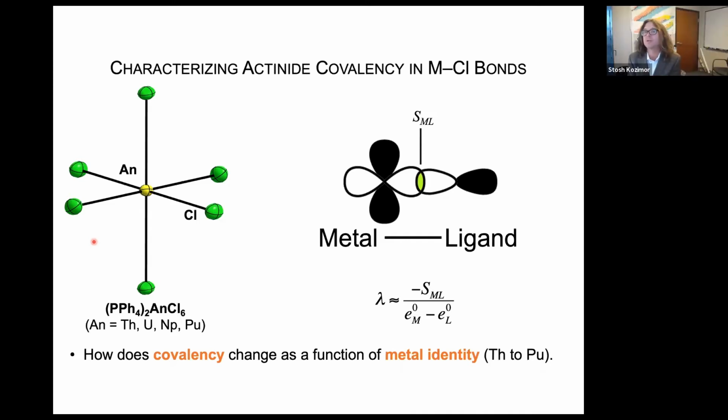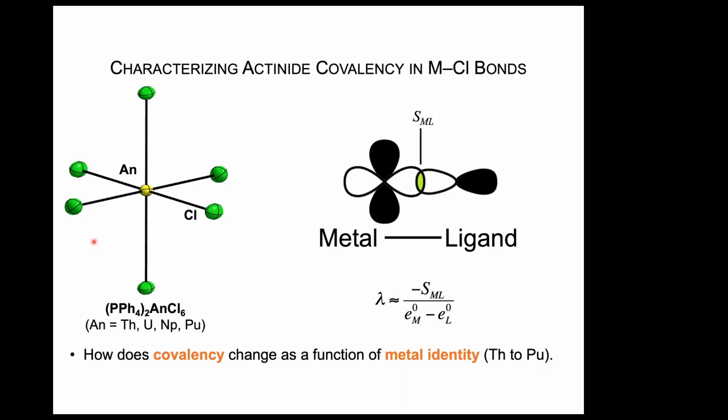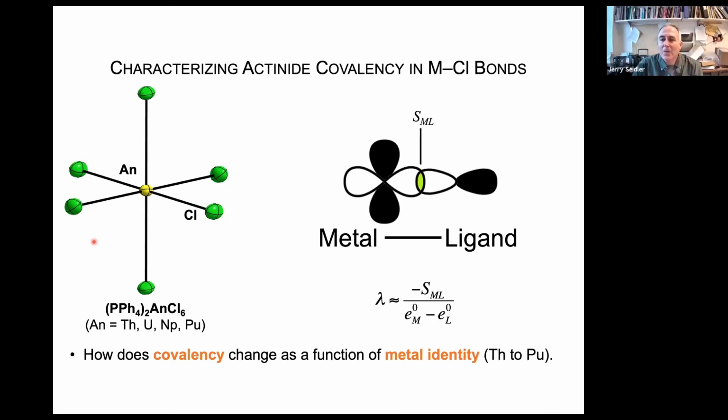Transmission is not an option. We can't blast through the sample. We can't get through it. We can't get fluorescence. Yeah, TEY might possibly be an option. All right. Yeah. We've struggled with that.